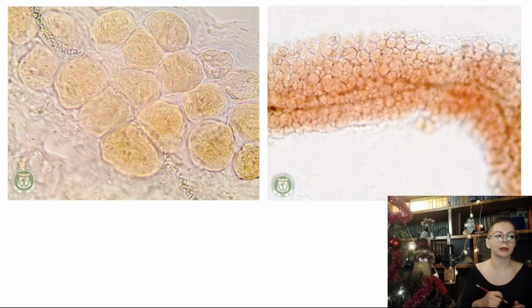So let's go further, and here we have the specimens of the white adipose tissue, and adipocytes. These are large cells filled with lipids. Sometimes blood vessels could be found, but it doesn't matter. This is a specimen that is foam-like, and I think it is very unique, and it is difficult to confuse it with others. So if you know it, you will recognize it in the exam, I think.